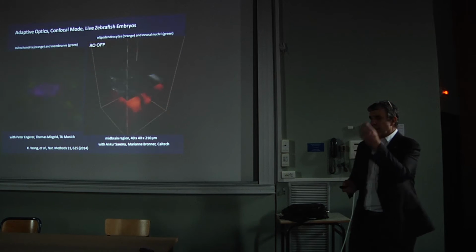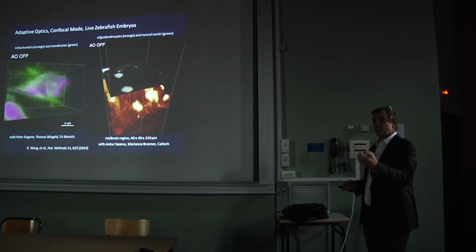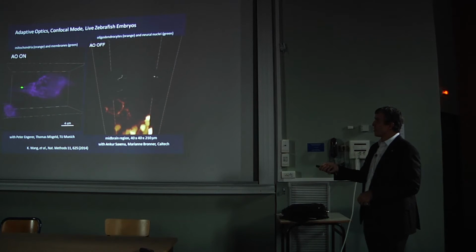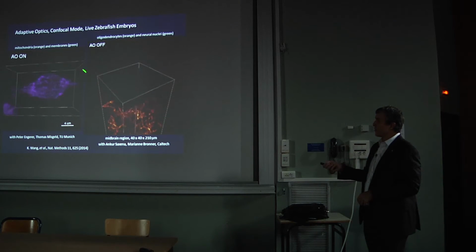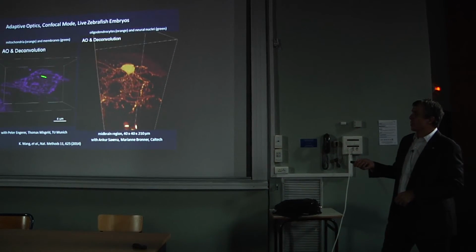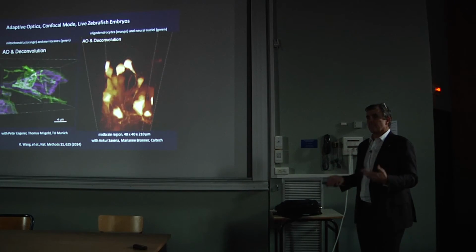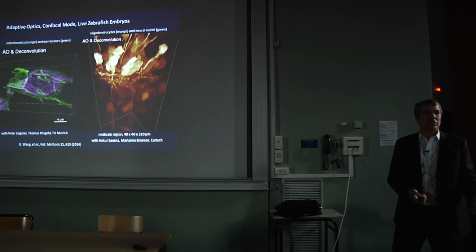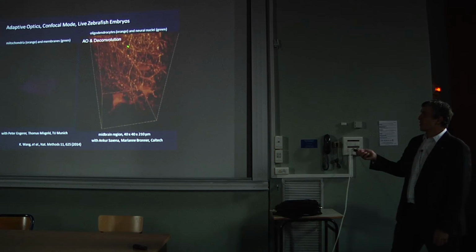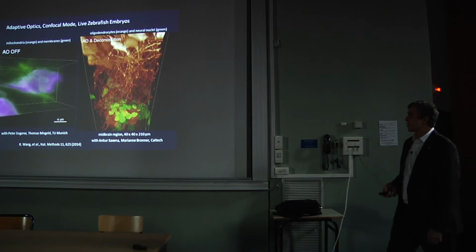So we can also do that and use the 2-photon as just our guide star, not as our imaging means, and then use confocal microscopy for the imaging to do multicolor imaging. So what you're looking at is a sweep of, first, that fuzz was the mitochondria in a cell that's 150 microns deep, but by the time we apply the adaptive optics and deconvolution, again, now we can look at cells deeply just as if they were cells on a cover slip, but now in the whole organism. This is doing it now, looking at oligodendrocytes and coming up the neural nuclei through the optic tectum region of the zebrafish.